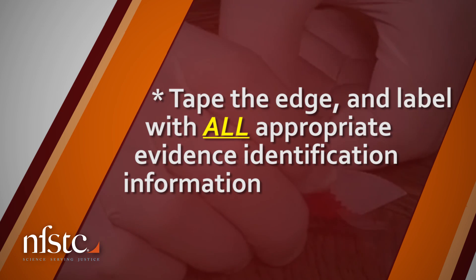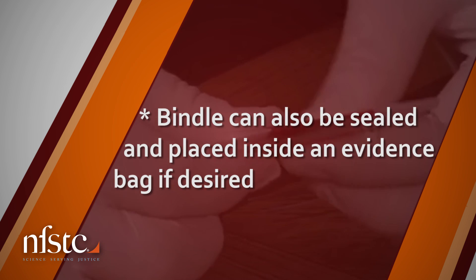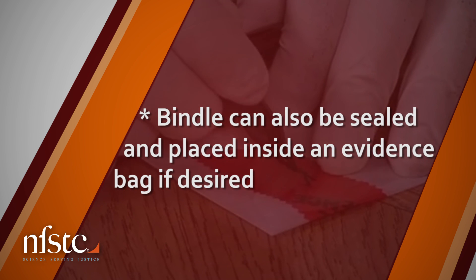Tape the edge and label with all appropriate evidence identification information. The bindle can also be sealed and placed inside an evidence bag if desired.